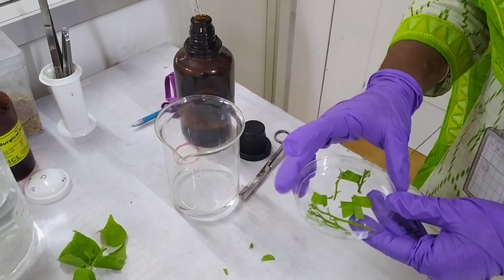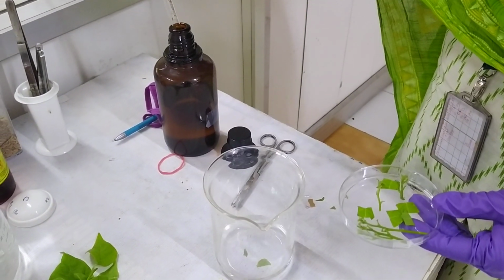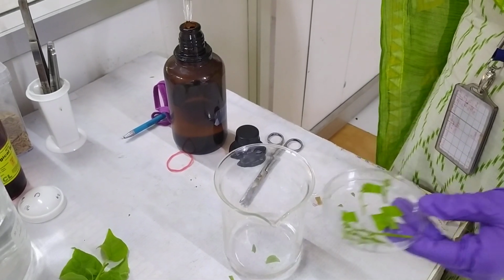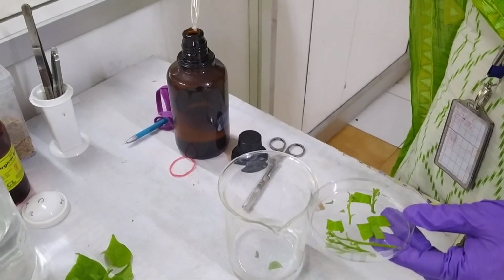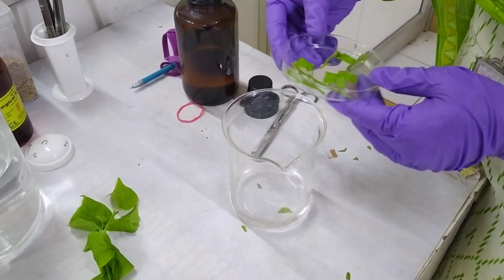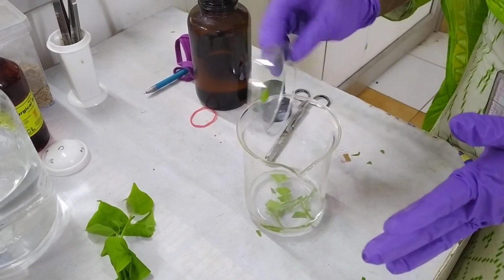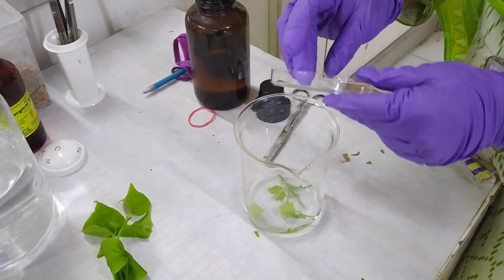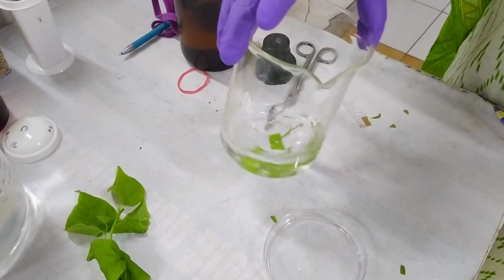In the water we have collected the explants in, I'm adding just 2 or 3 drops of Tween. Once it is done, dilute the Tween, put in your explants, and keep shaking it.